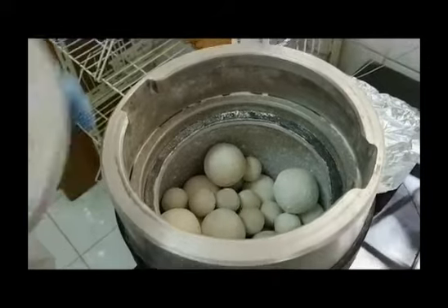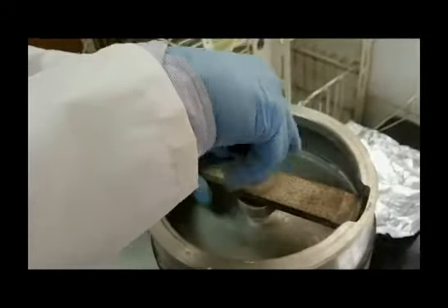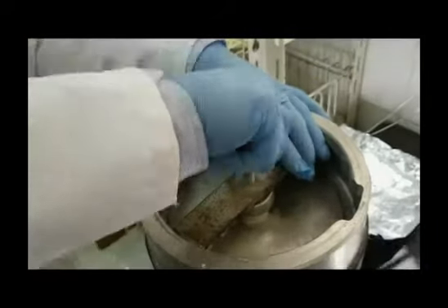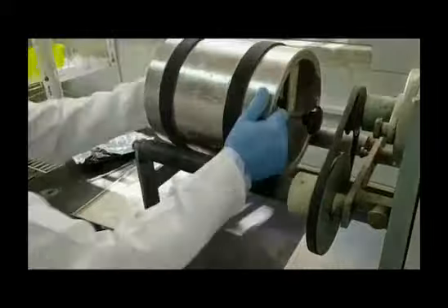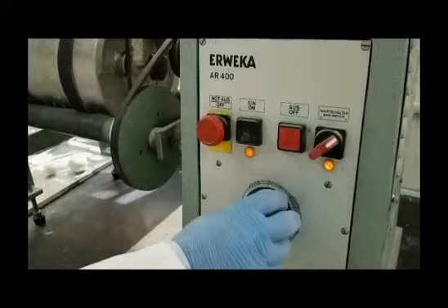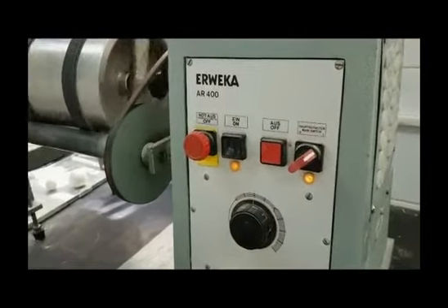Now, secure the gasket and lid of the milling chamber. Put the miller tightly and place it on the rollers. Start the milling process and turn the miller on at 30 RPM. Commence milling and timing simultaneously.